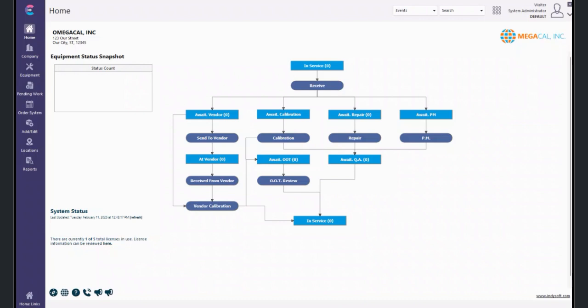Last August, we did a Tip Tuesday introducing you to the Configuration Changes Utility, which tracks changes across 10 configuration areas as an electronic record. Pretty cool. In regulated industries such as biomedical, it is critical to maintain the calibration database in a validated state. This validated state includes effective audit trail of configuration change revision levels and objective evidence of robust configuration change testing.